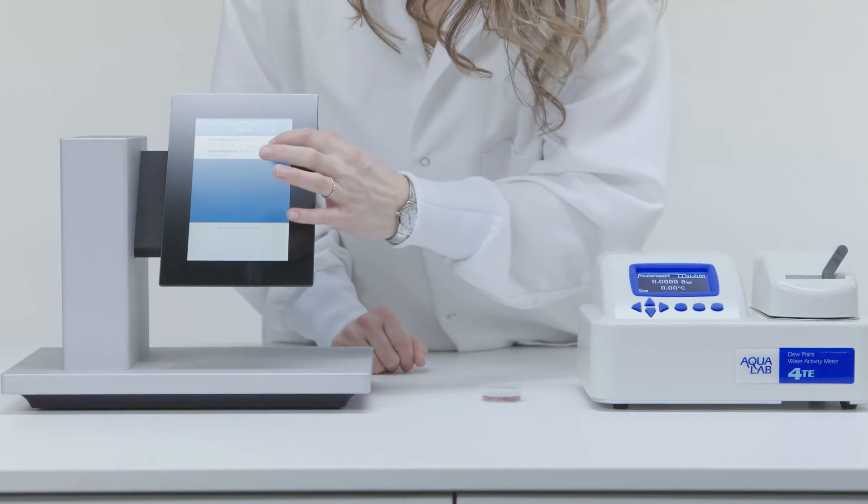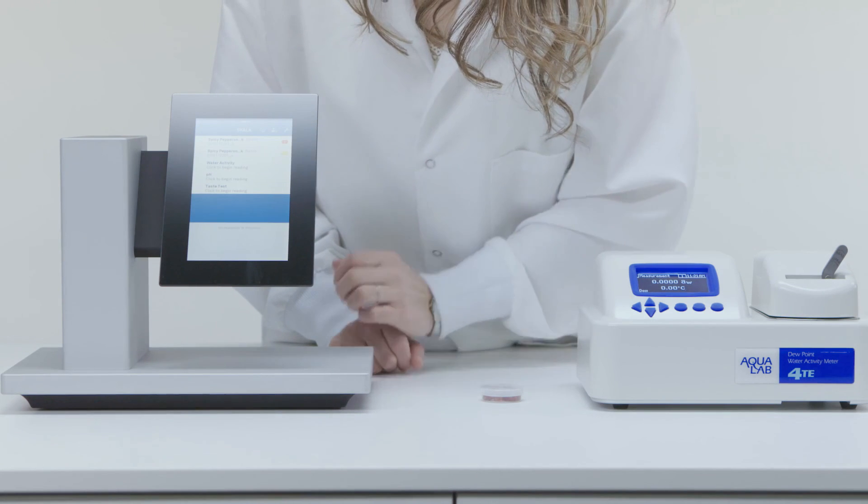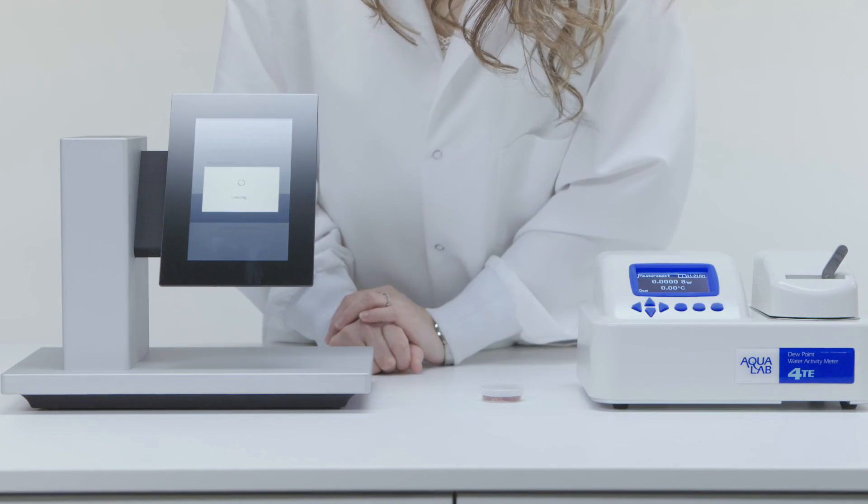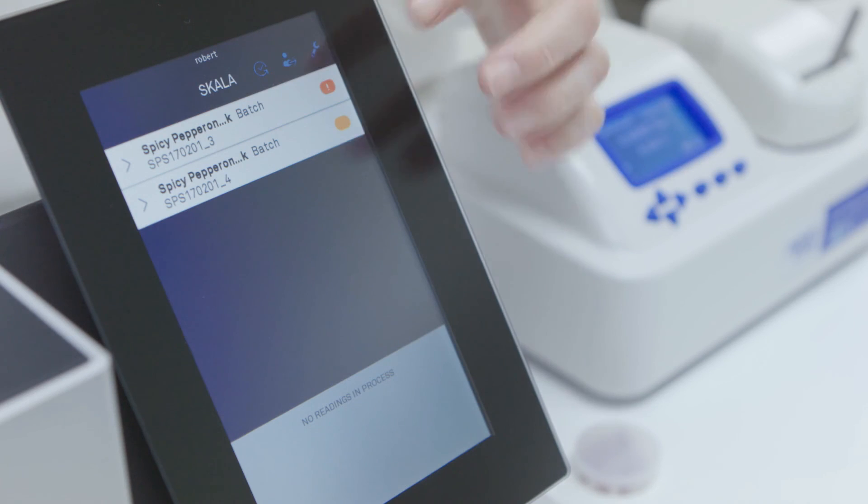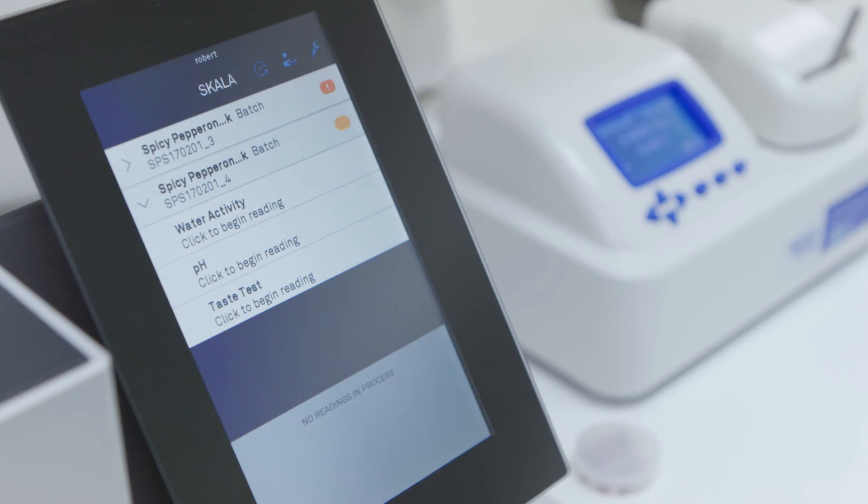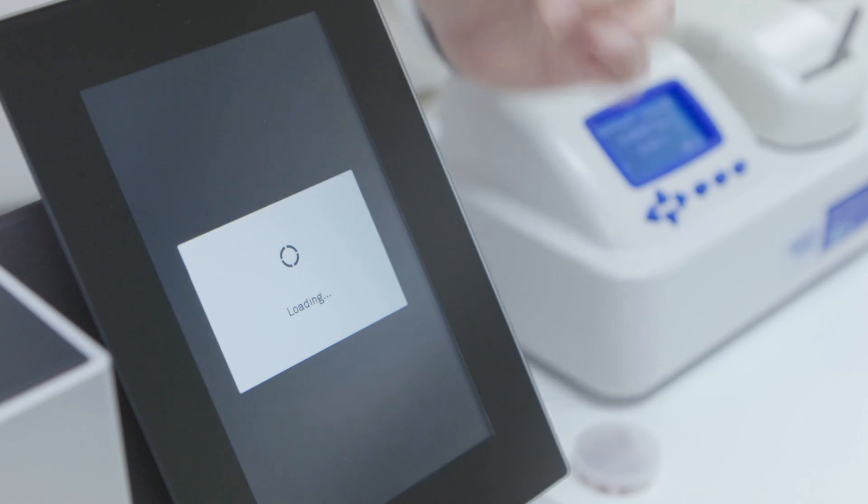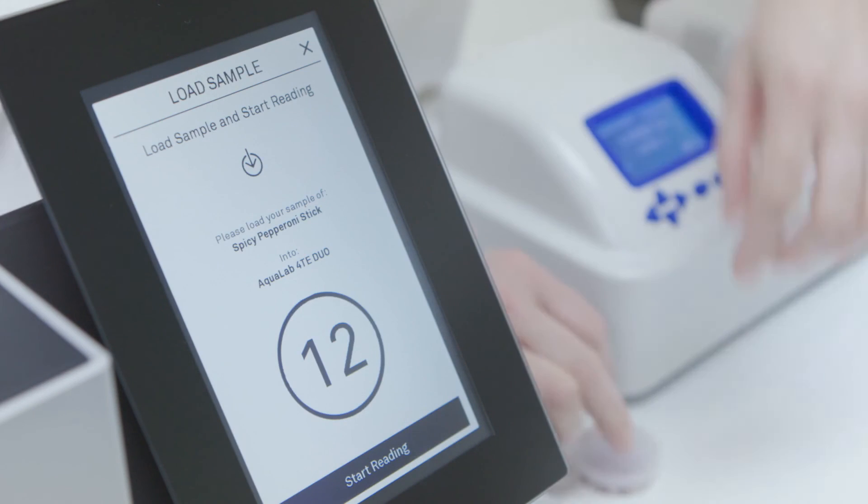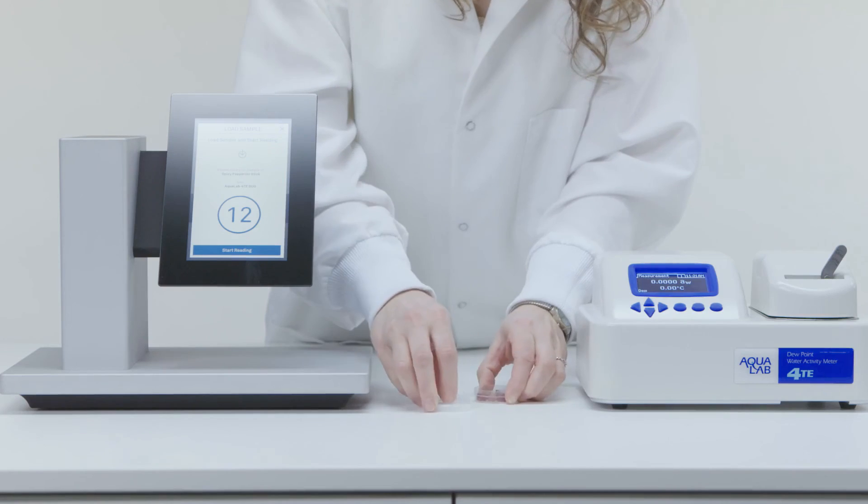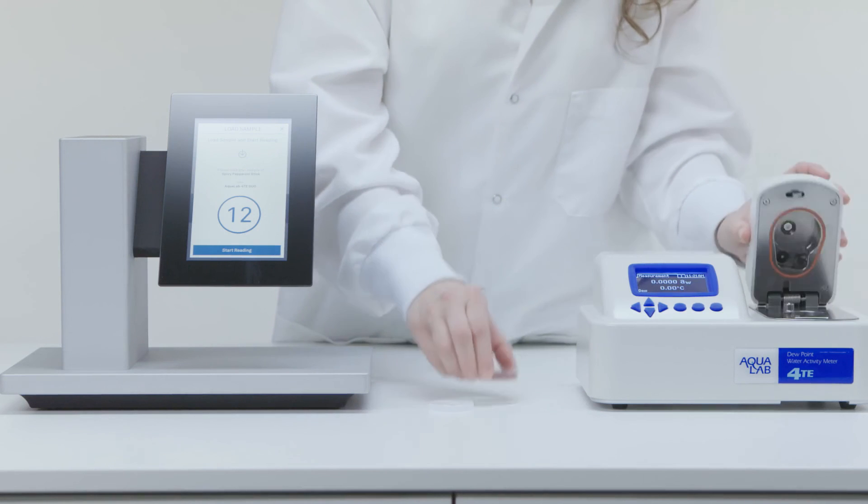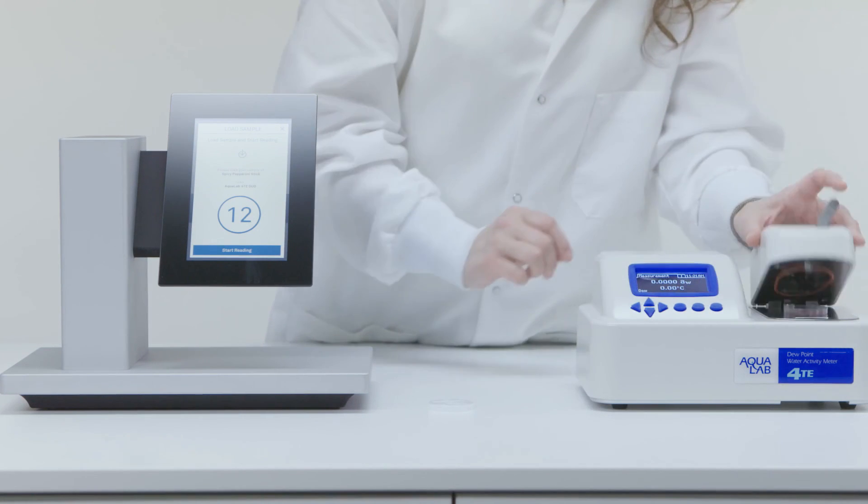We're going to designate the lot number for this sample in Scala, but you can do this manually also. Remove the lid if necessary, and put the sample in the Aqualab. Close the top and slide the lever to read. Scala will listen for and record the reading, but you can also check the reading on the Aqualab screen.